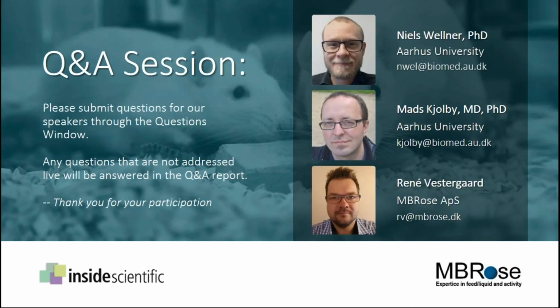Yes, I can try. The system observes only the amount of food and water that is ingested at any given time. You are not able to control meal size or access to food or water in the system, for example to shut it down for an hour. If you want to shut down food and water intake for all mice, you will have to close it manually. Okay.